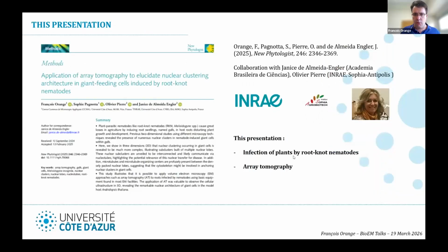So in this presentation, I'm going to talk to you about a paper which we published last year in New Phytologist. It was a collaboration with people from the INRAE, the Agronomy Institute in Sophia Antipolis, a few kilometers away from Nice, and mainly with Janice de Almeida Engler, who is from the Brazilian Academy of Science and has been working for possibly more than 30 years on root knot nematodes and galls. So in this presentation, I will talk a little bit about infection of plants by root knot nematodes, and later on array tomography.